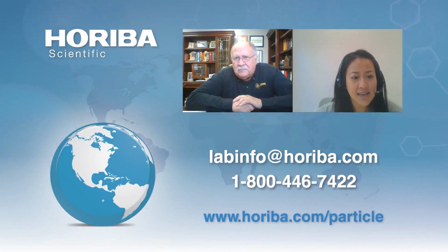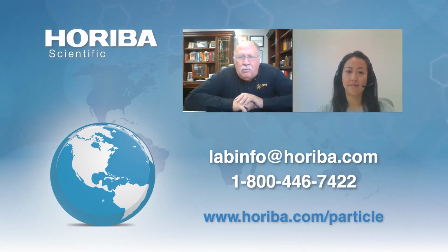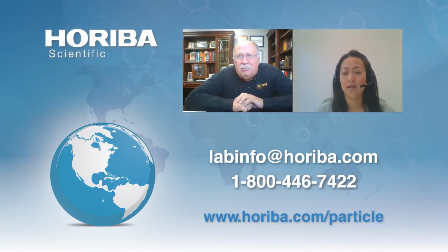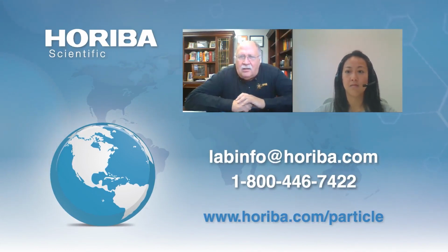Okay. Any idea on how you can measure particle size on brown sugar, which contains about 3% moisture, where particles are sticking together? The way we would handle that one is we would probably use a HORIBA system, and we would do it in hexane. I agree. Yeah, that would be the best way to do it. So the particles that are sticking together, hopefully they'd come apart in hexane, and you'd be able to measure them very, very readily, without having to worry that water would interfere with the particle size.